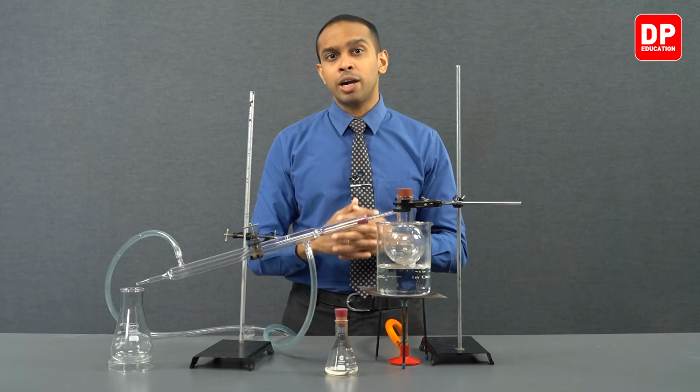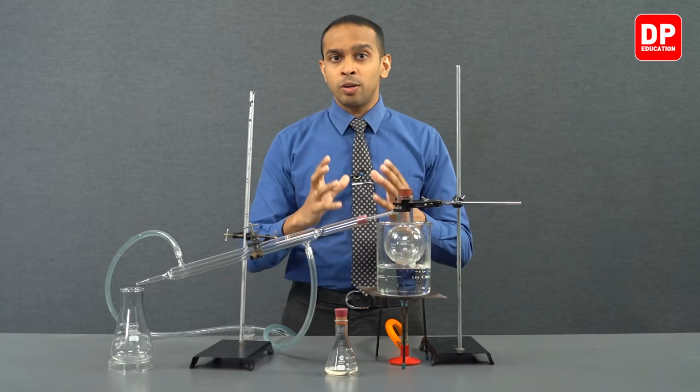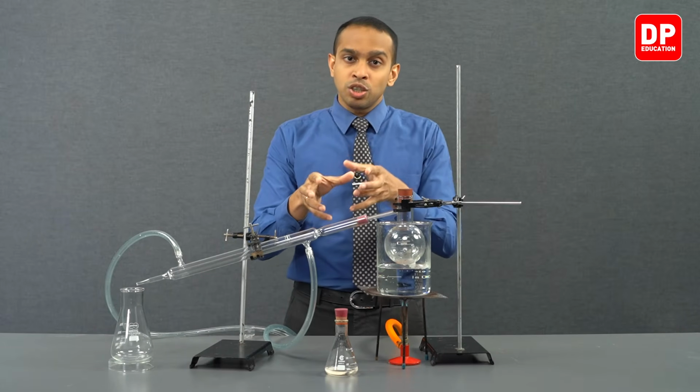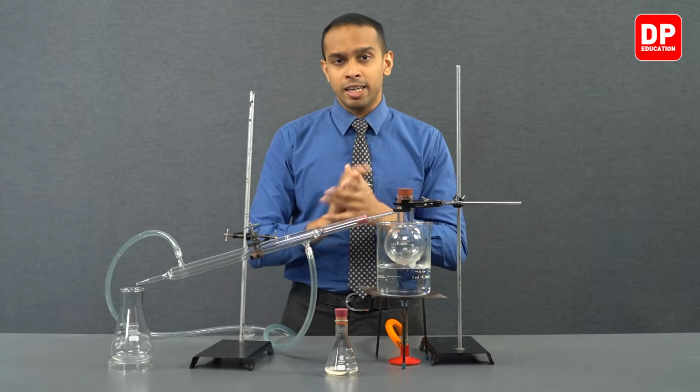And we actually carried out solvent extraction 3 times to make sure that all of the essential oil that is present in the aqueous medium was removed onto our diethyl ether layer.